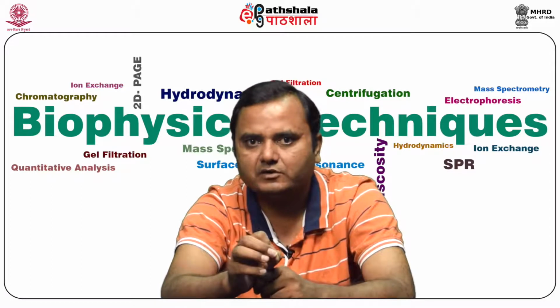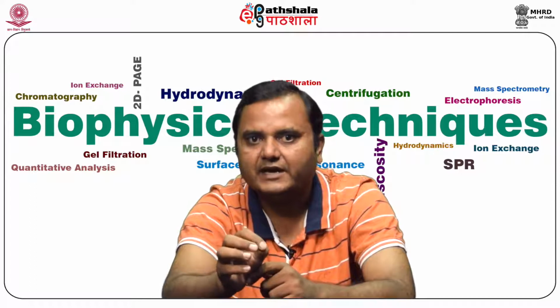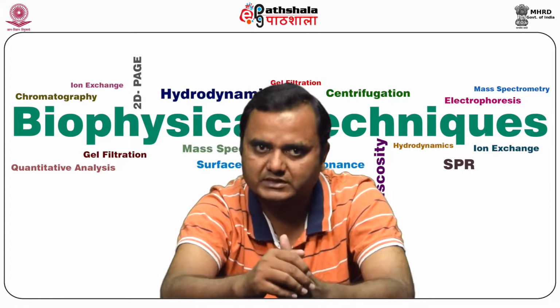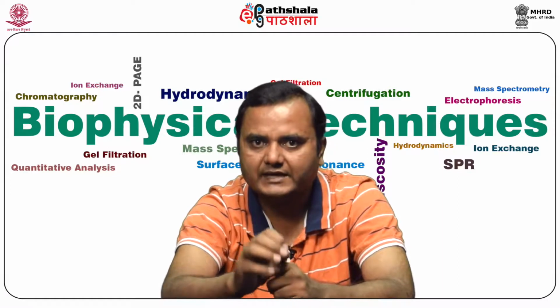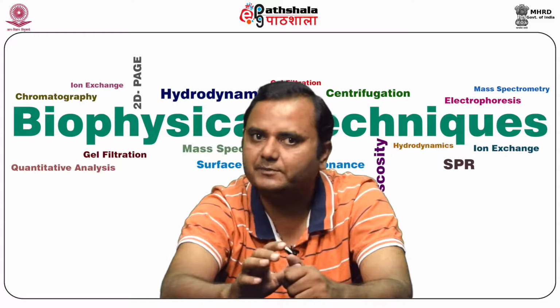Fixed concentration or linear gradients increase the density and the viscosity and decrease the sedimentation rates. That's why sucrose is used. It prevents the sedimentation of molecules with densities less than the medium. By controlling the time and speed of centrifugation, a significant purification can be obtained.